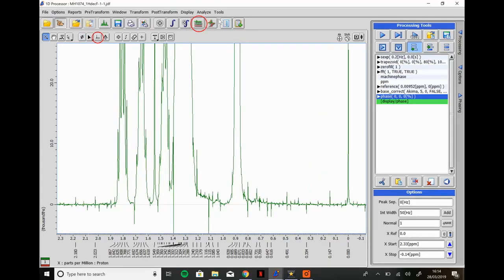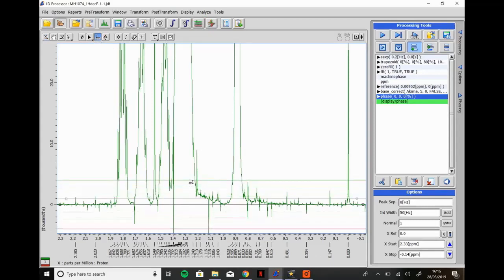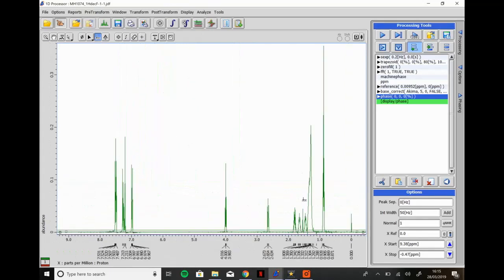Press the Compute and Show Statistic button first to show the lines on the spectra, followed by the Baseline button. Move the green line up to the point above which you want peaks to be found and press the cross button again to show the changes. Integrating is done by selecting the Integrating button on the tab.